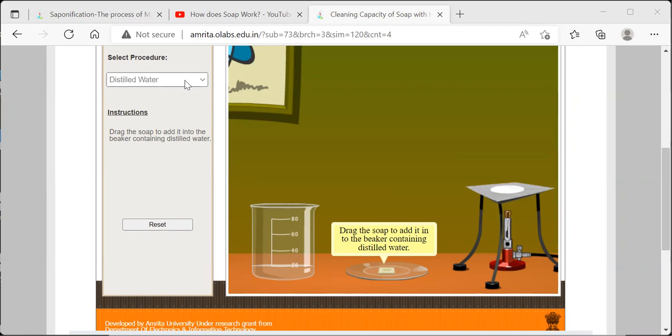And here, distilled water is considered soft water. Well water is going to be hard water. And distilled water plus calcium chloride is considered very hard water. The steps for each are going to be very similar, so follow along with all the steps that I'm going to perform now. Let's first start with the steps for the distilled water.